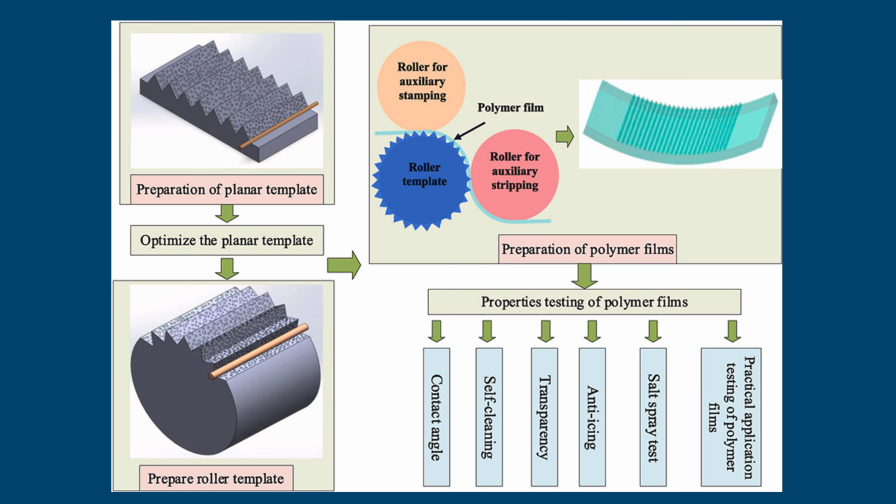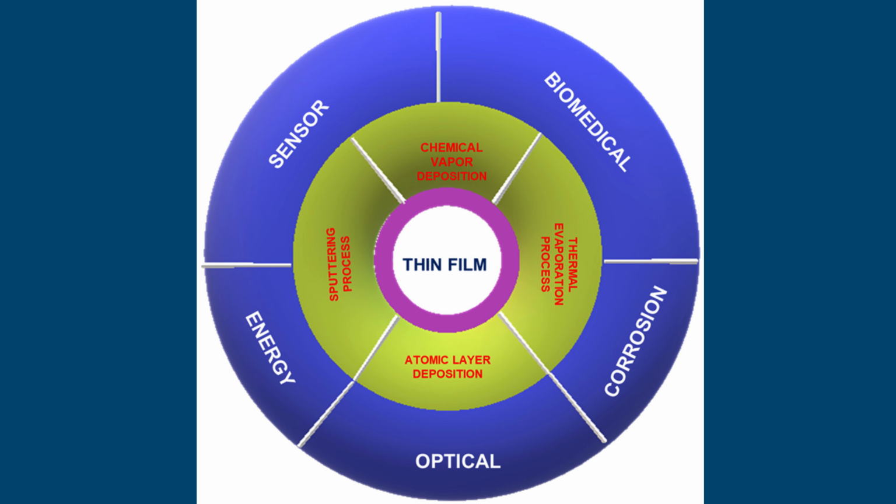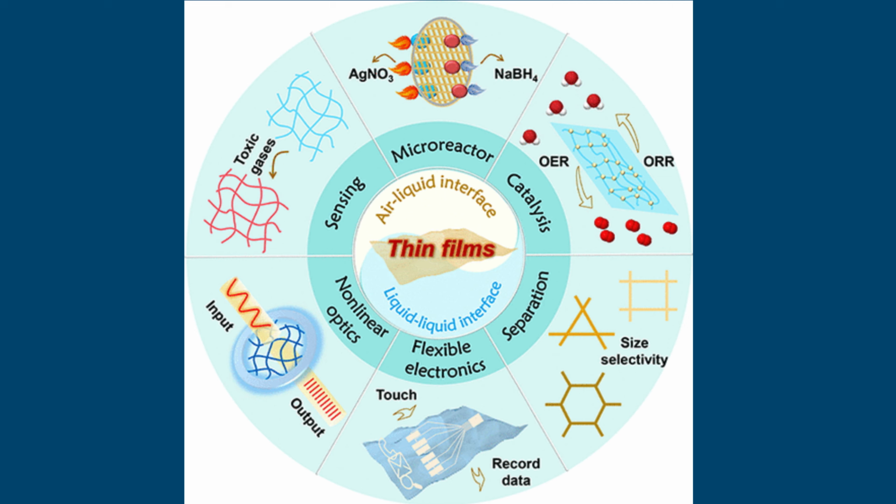From an engineering standpoint, it facilitates the selection of appropriate fabrication techniques, optimization of production processes, and improvement of product performance. Future developments in polymer film preparation are expected to focus on environmentally friendly and solvent-free processing technologies, precise nanoscale thickness control, and the development of advanced functional films such as conductive, biodegradable, and stimuli-responsive materials. Integration with emerging technologies, including flexible electronics and energy systems, as well as the advancement of scalable and high-precision manufacturing techniques, will further expand the role of polymer films in modern technology.